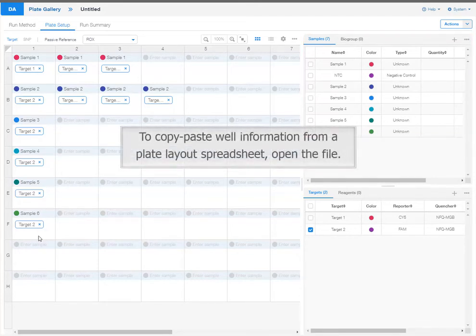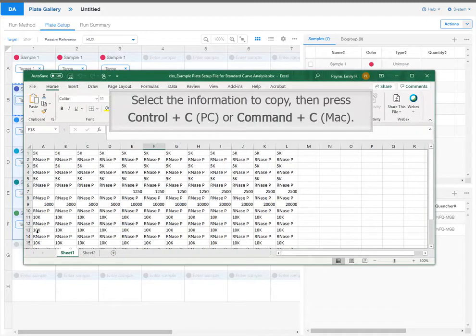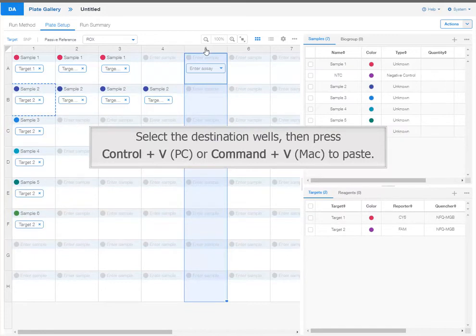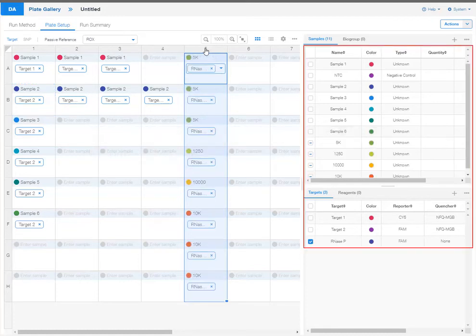To copy paste well information from a plate layout spreadsheet, open the file. Select the information to copy, then press Ctrl C or Command C. Go back to the plate layout. Select the destination wells, then press Ctrl V or Command V to paste. The new sample and assay information is added to the tables.